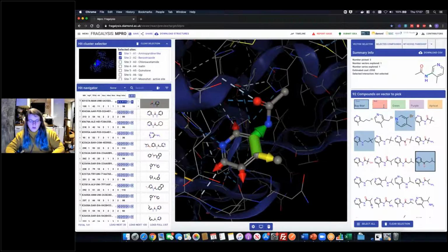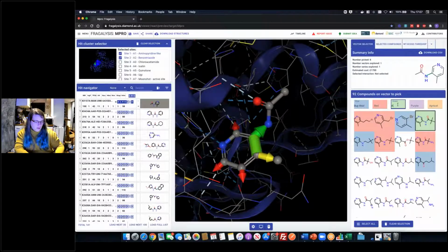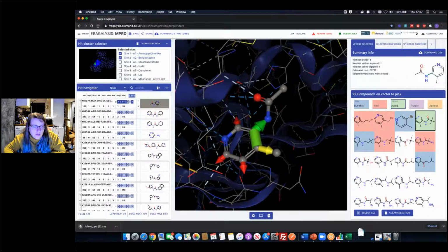Then to use a new filter, you can just click on enter on the filter and then it'll change color. I believe, does it work still? No. You used to also be able to use the number keys on your keypad to change that color, but I think that has now changed. Okay, so just click and enter. And you can add the categories as well. So for example, avoid. And once we have that list, what we can do is we can download a CSV file that contains the information on those selections.